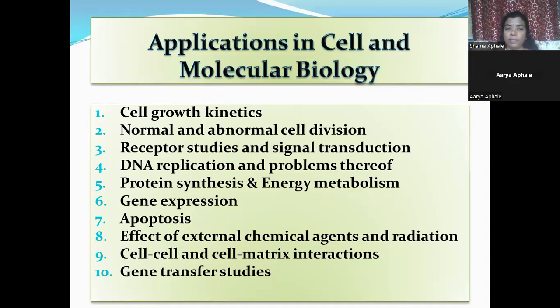So, for example, what is the growth rate of a particular cell line? What is the rate at which it is growing in vitro? What is its viability at 24 hours, 48 hours, 72 hours? Such studies can be performed for cell growth kinetics.